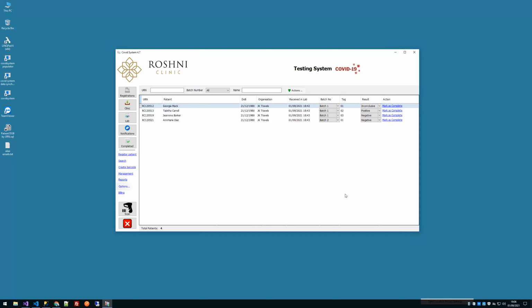But they use different machines, and they've got similar concepts but different terminologies. And for that, I wanted the system to incorporate both without being too bespoke, otherwise it's pretty much not usable for anyone else. But ultimately, the goal is you've got something in structure. You know how to reference the well numbers with the actual test in the system. You know how everything links together, and you know that the system can take patients in from online or through the system and produce results: certificates, SMS, emails, and so on.